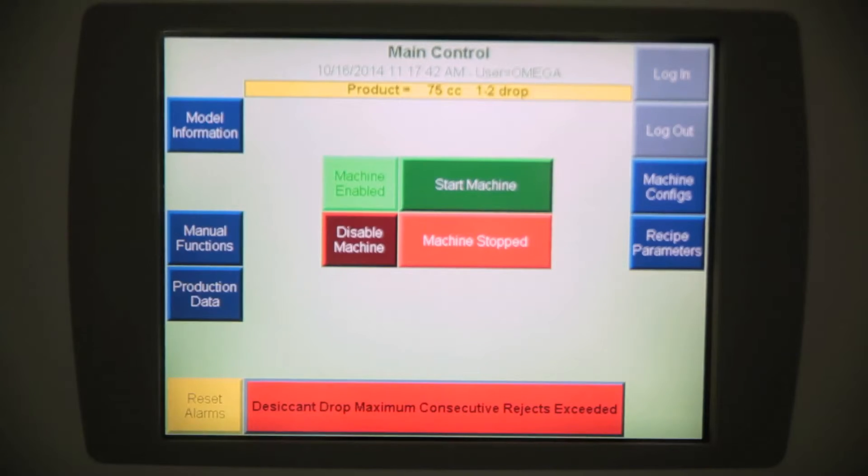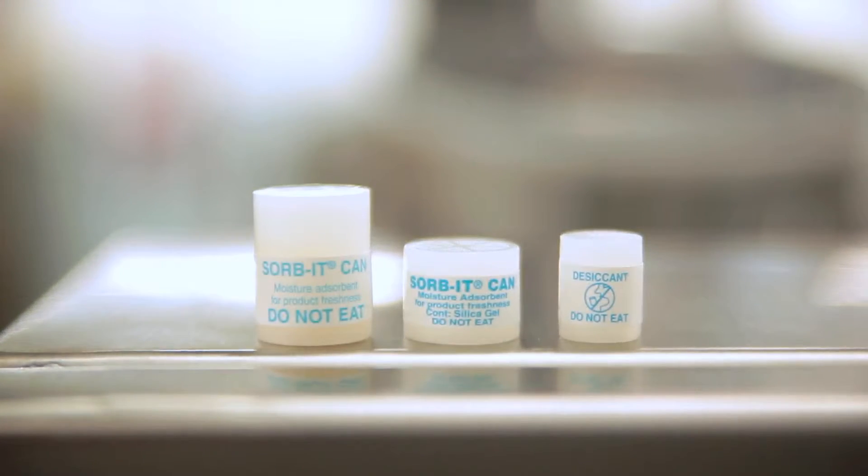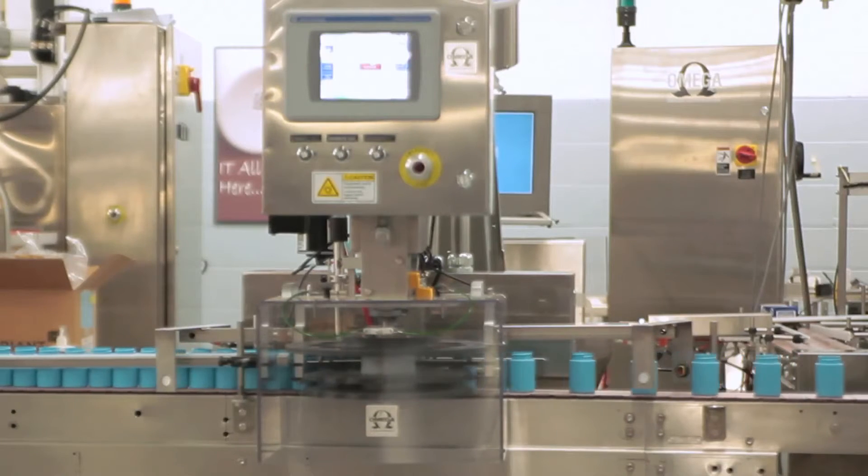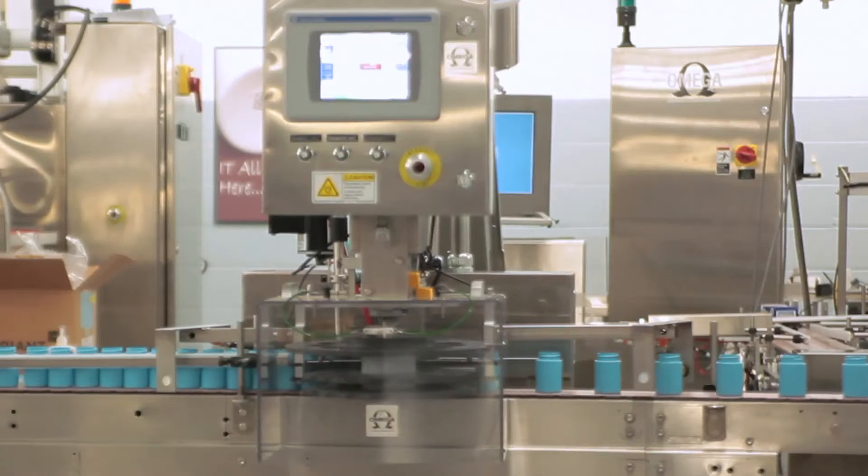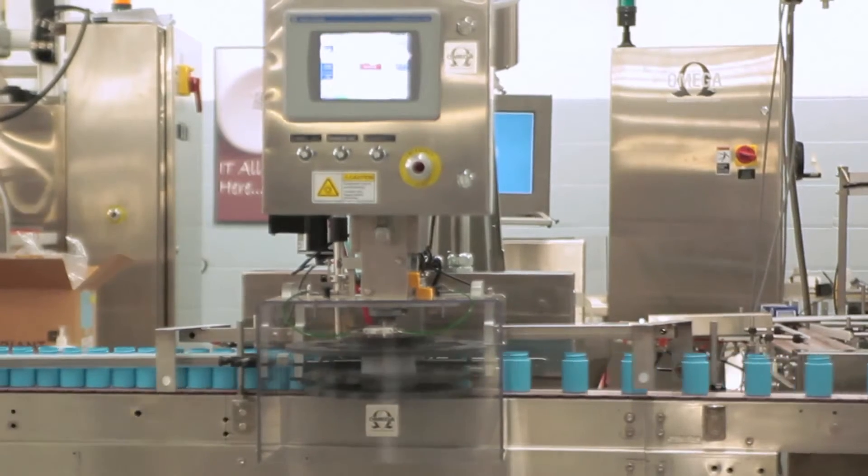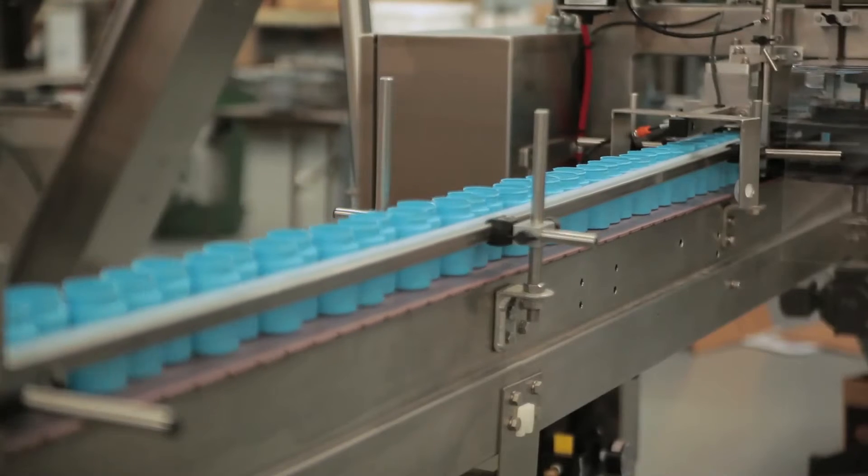Canister feeders from Omega Design Corporation are designed to accommodate a range of canister sizes with the ability to dispense single or multiple canisters per bottle at high rates of speed ranging from 50 to 600 per minute.